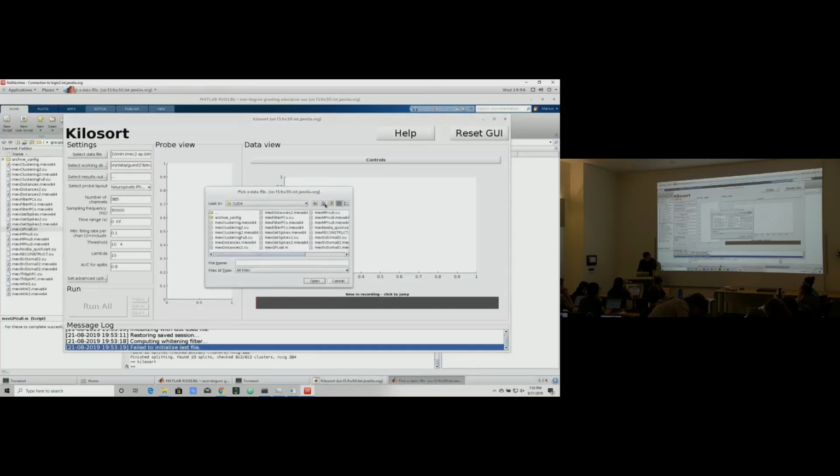Okay, and so what you do is you select data file, and again, you want to select your own copy of data. So I've gone up all the way to hackathon. So just to be clear, the whole structure here of the entire Janelia server is there's this kind of file server up here, and then everyone's in groups, including the labs, and then we are in hackathon. And so in hackathon, there's just the name for it. We go to data, and each of you has made a folder there, and I've made one in guest 23. I'm going to go in guest 23, example data.